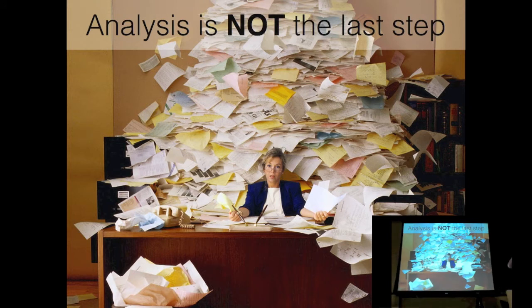So my first piece of general advice is that analysis, even though it comes at the end of your experiment, really isn't the last step. You don't want to be a scientist that feels like this, where they have a giant pile of data that they haven't looked at yet and they're trying to get some result out of. The reason for this is not just so you don't feel so overwhelmed, as she probably does, but that it's not necessarily obvious what aspects of the experiment are the most important in order to make your data analyzable.